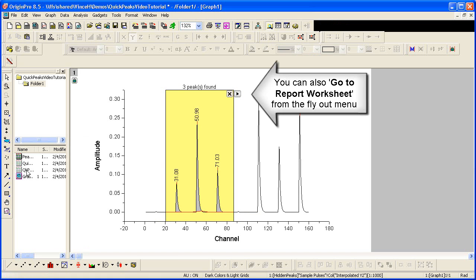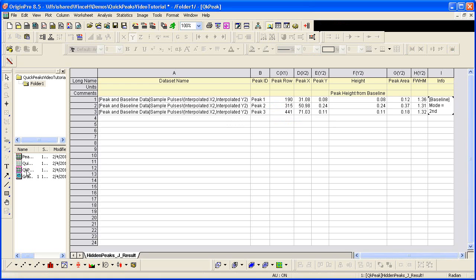Data is output by default to a worksheet called Quick Peak. And you can see that peak parameters are put in the worksheet.